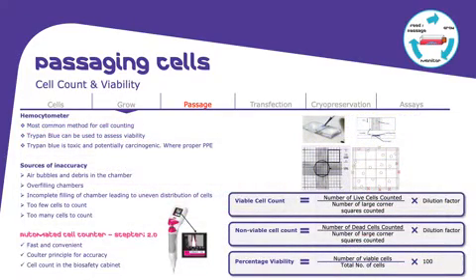I would like to stress it a little bit more. It is very important to count your cells and to analyze the viability of your cells, because all your downstream applications depend on the quality of your cells.